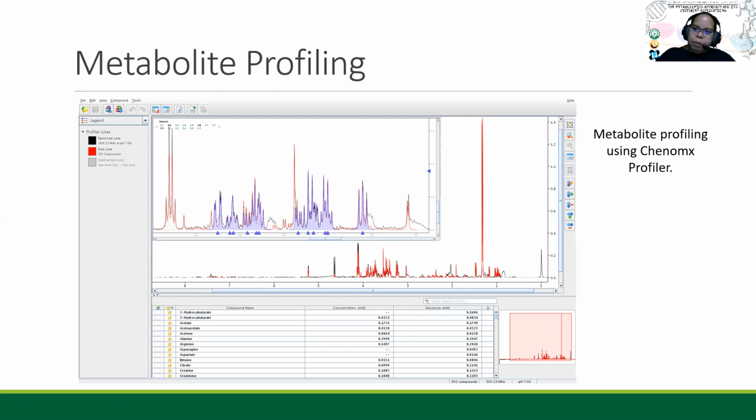So I'll make use of the 5.23 ppm peak to adjust the actual height of the signal for that. And that will correspond to changes also in this region. And from there, you'll be able to see what the contribution of glucose is in this particular region. So it's actually fun to do, like building a puzzle.